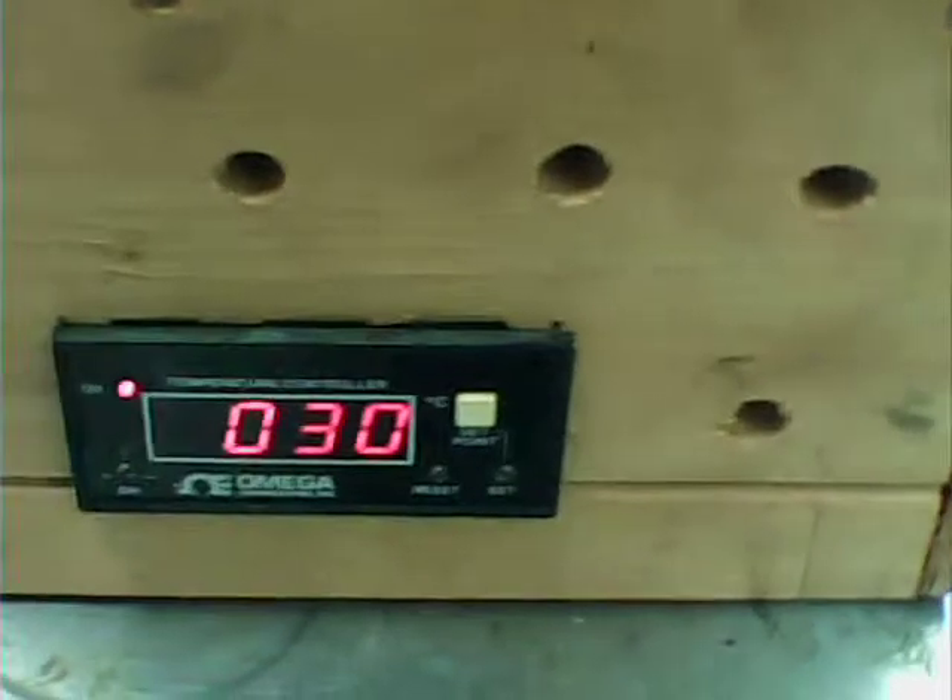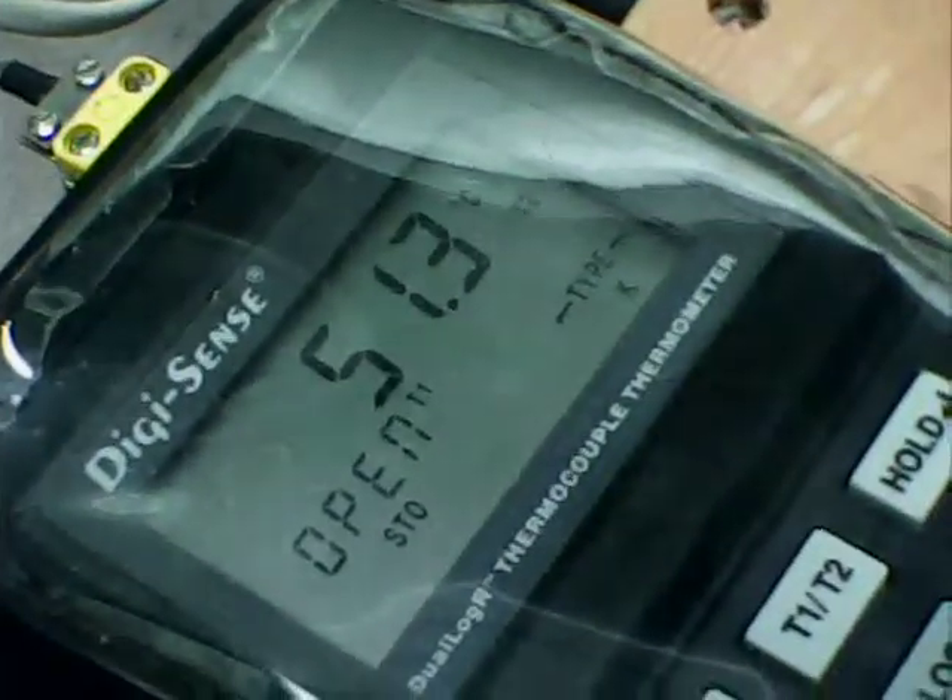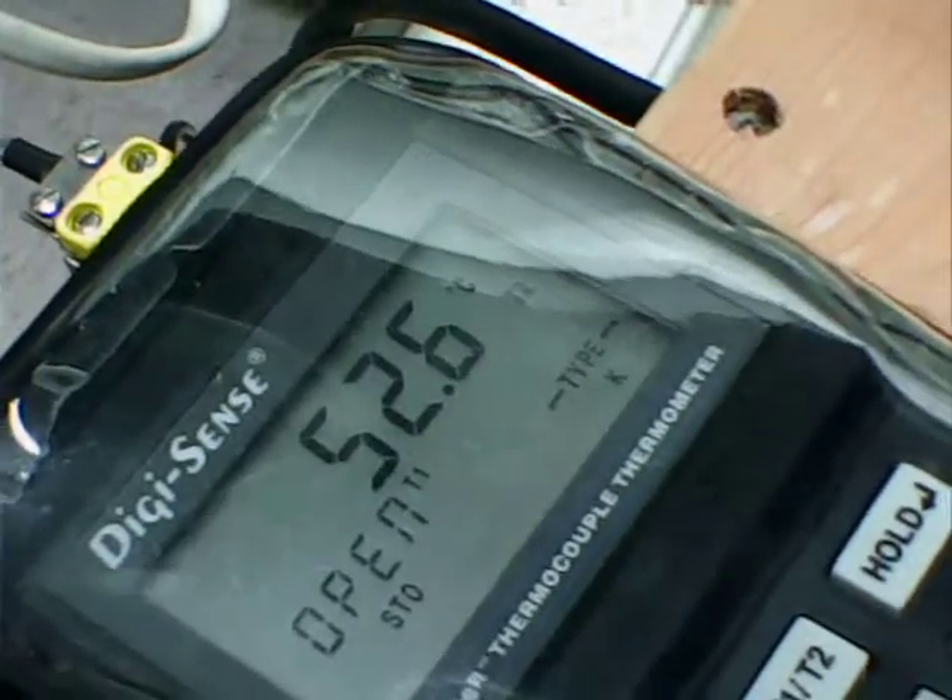The autoclave is warm to the touch, it's reading 30 degrees, but yet this is telling us 50. I don't have to adjust it because this one's actually going to be more accurate. That marker says 53, but maybe they'll reach equilibrium.